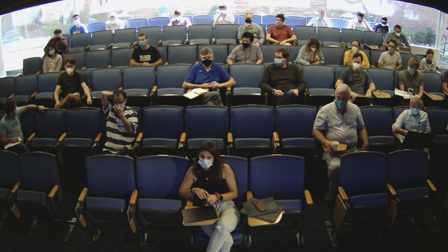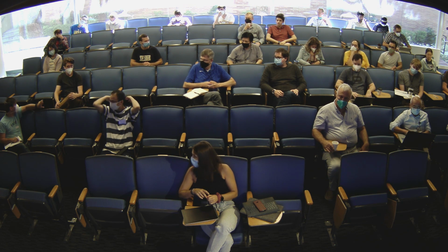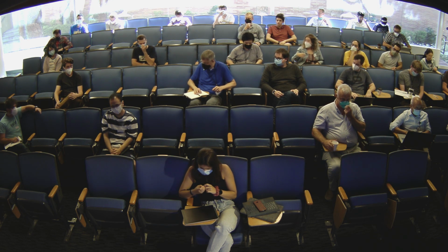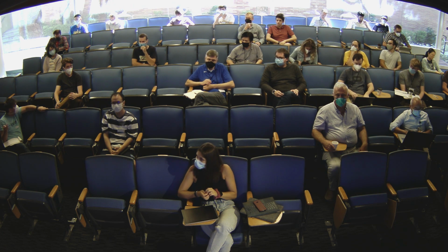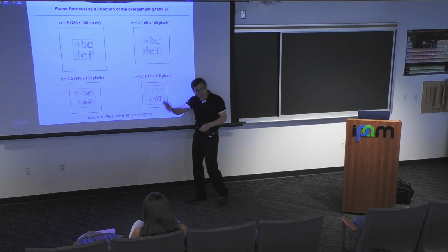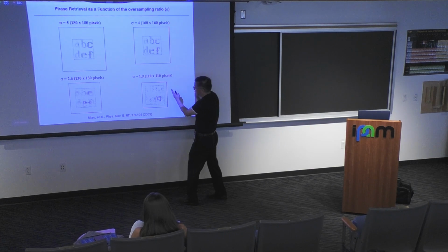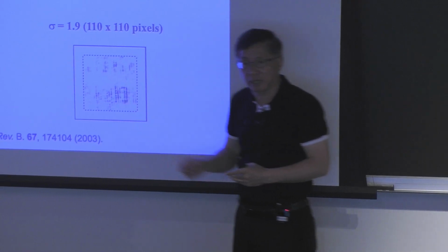Well, no, I don't think so. I think the problem is really how well determined the problem is in Fourier space. Because what he is posing is the problem of reconstructing the phase under the assumption that outside the dotted square, the signal is 0. From what I understand, that's right. This is what gives you the extra information to retrieve it. So in each iterative algorithm, we always push the outside close to 0. So it's still a periodic function. You say the DFT is always a periodic function, but this periodicity doesn't affect the structure inside, normally constructed.